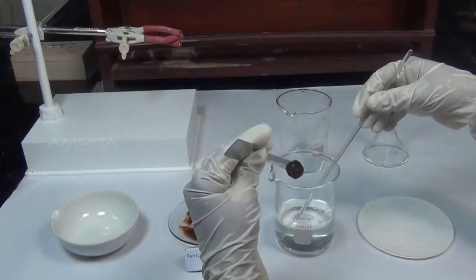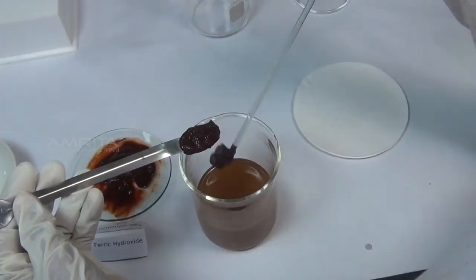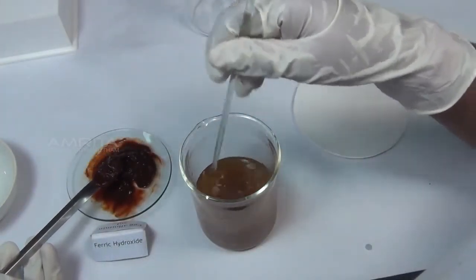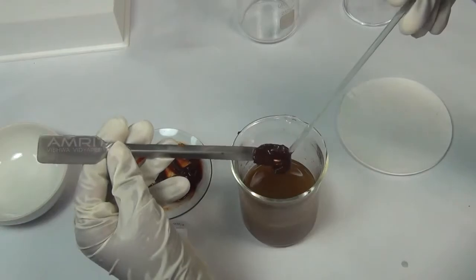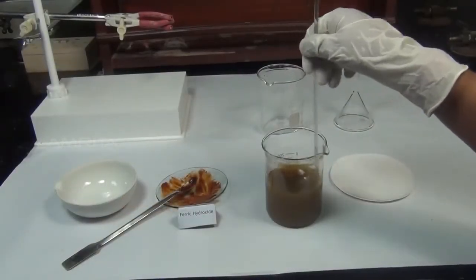Using a spatula, add freshly prepared ferric hydroxide precipitate in small proportions to the solution of potassium oxalate and oxalic acid with constant stirring to dissolve the precipitate.